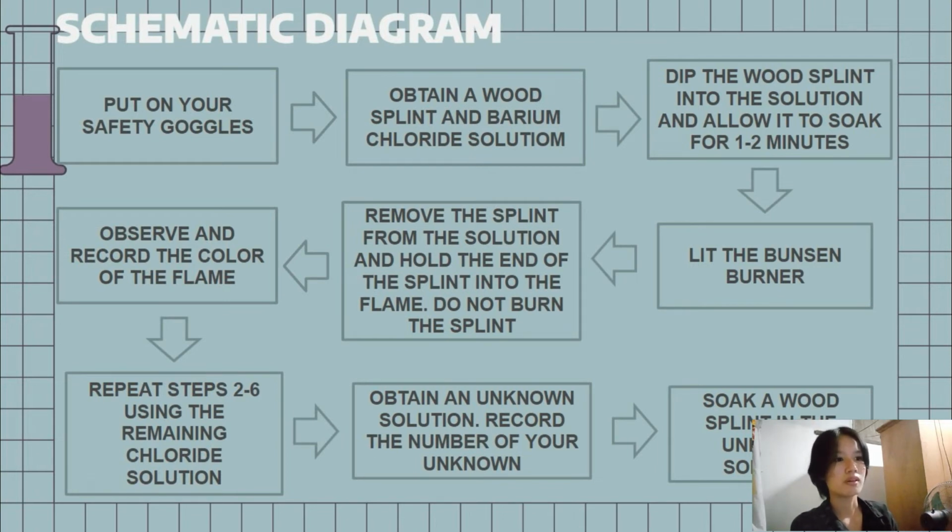Then observe, and record the color of the flame.